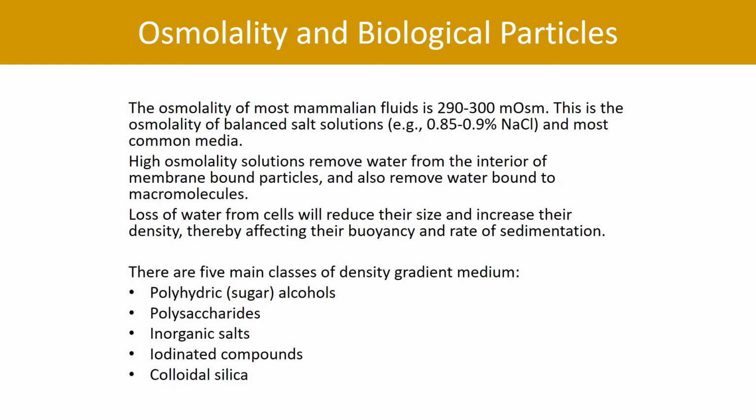Loss of water from cells will reduce their size and increase their density, and therefore it will affect the buoyancy and the rate of sedimentation. So therefore, osmolality has to be given extreme attention.